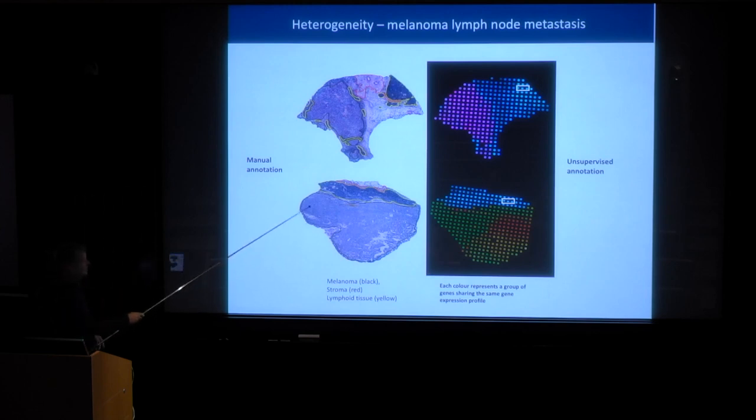And obviously, if you think about digital pathology, you would never find this kind of pattern if you hadn't looked into the gene expression profile. The histology in itself is not sufficient.